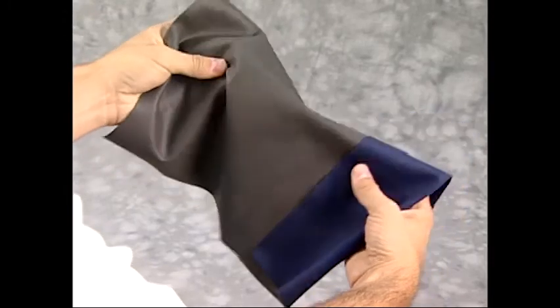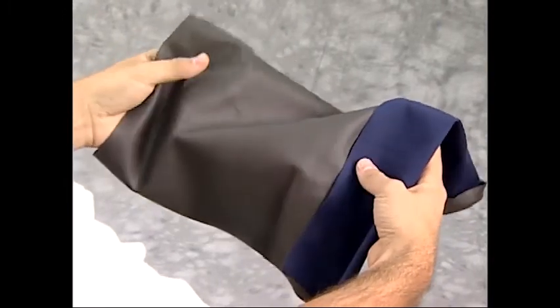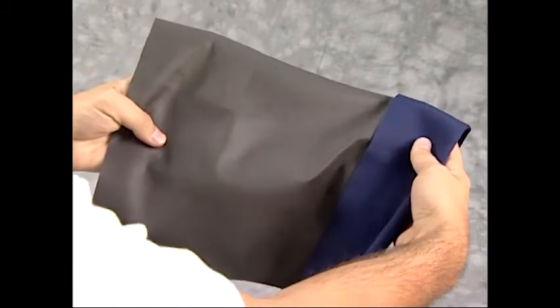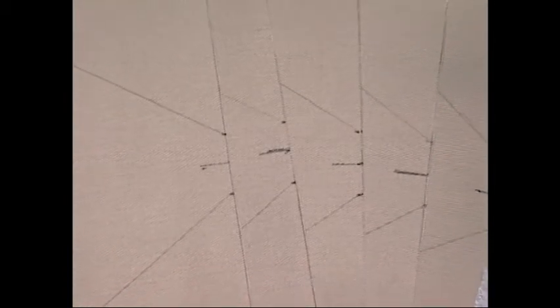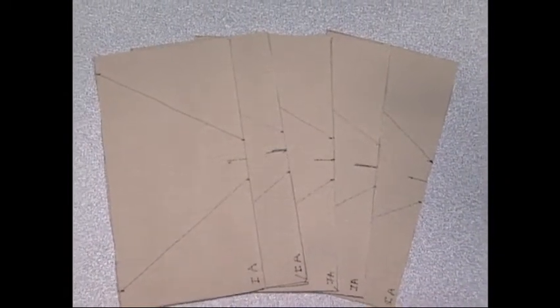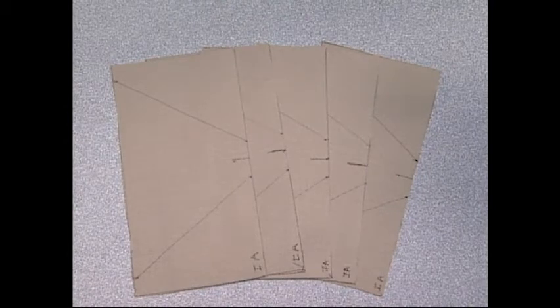The fabrics may be loom state, untreated, dyed only, coated, resin-treated, or other conditions. The test is performed on dry fabrics, but can also be performed on wet fabrics. The specimen is marked with a rectangle with an outline of an isosceles trapezoid. The specimen is slit at the center of the smallest base of the trapezoid to serve as the starting point of the tear.